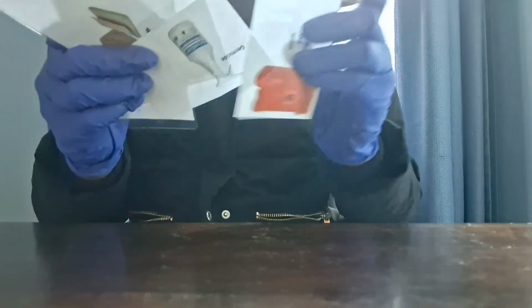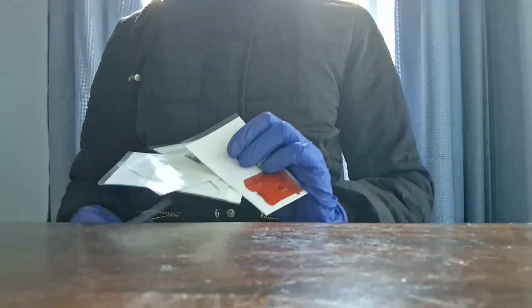Then after, I would have to use the germicide all over the table.